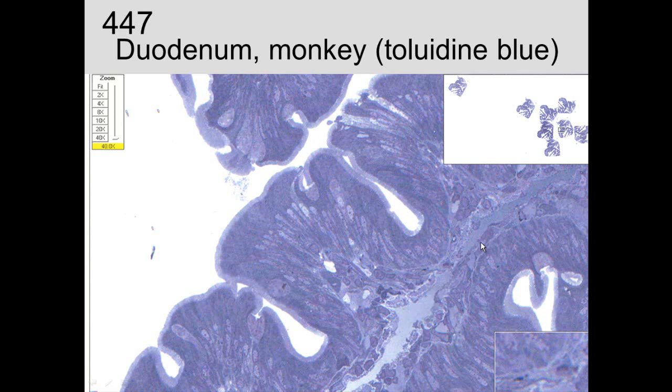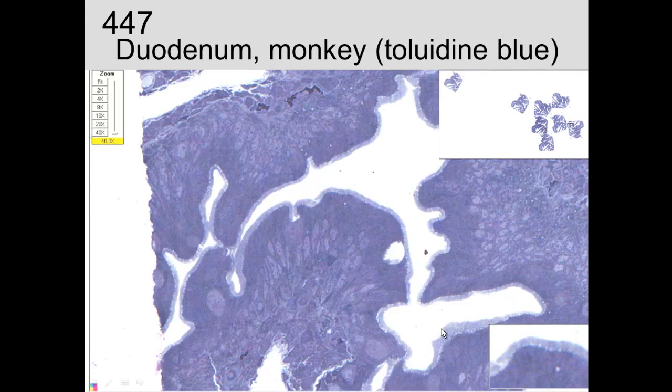Central lacteal, as we see through there, there are places here where blood vessels are running through. There's a capillary right in through there. Here we can see another one. Again, we can see the brush border projecting up. Individual columnar cells, more cytoplasm above the nucleus and between nuclei, so a simple columnar epithelium lining these.